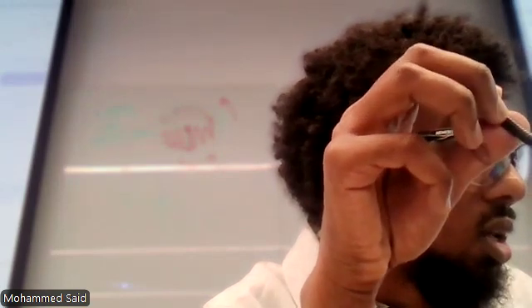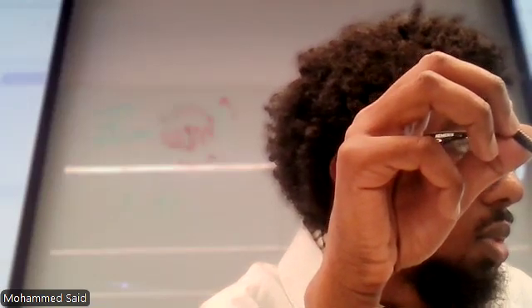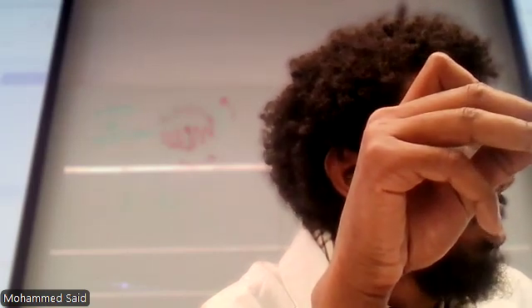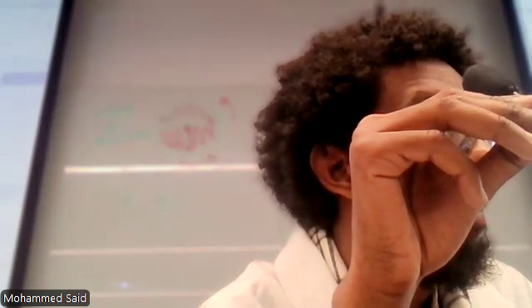It's 23 seconds, right? As we are adding it, it's already finishing 3 tubes. It's not going into 5. How much did you have to start? It's 4 pages filling, so that would have been 1.5. You should have enough. Should I be doing a wrong calculation? One minute.